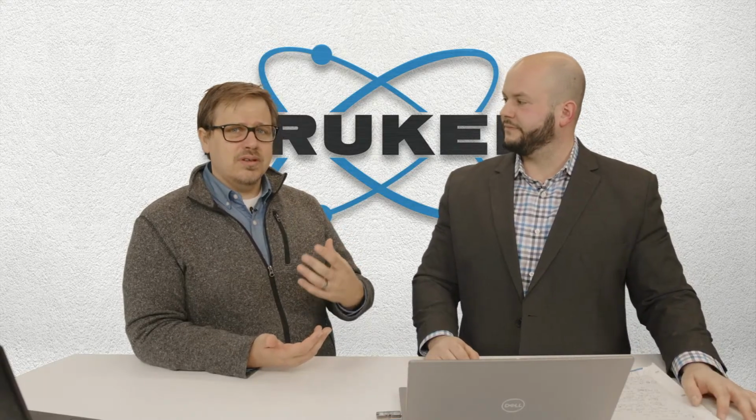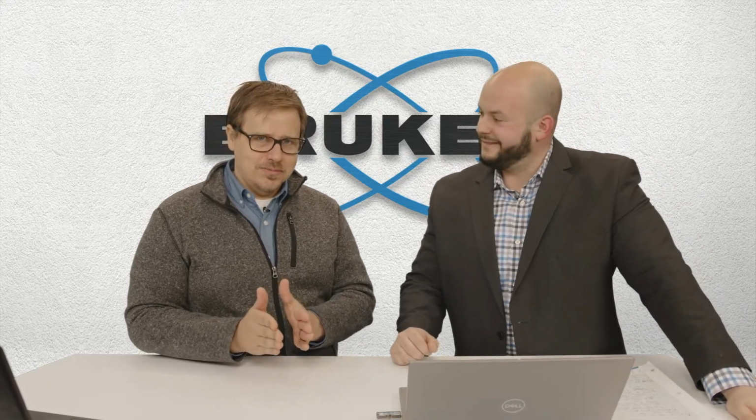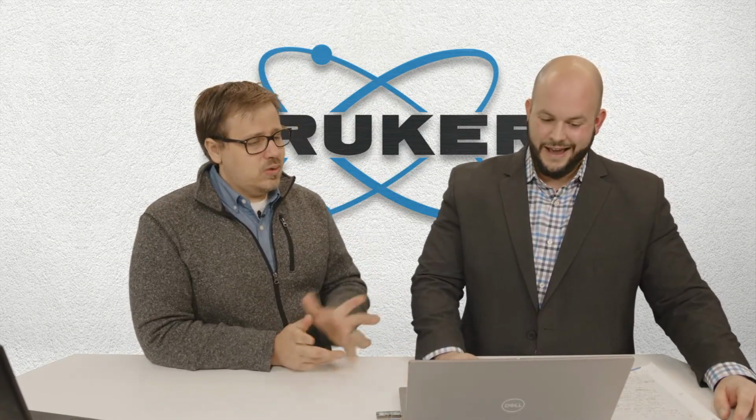One thing to think about, though, is the topic of over-refinement. Right, you can fit anything. You can make the software fit anything you want using almost any parameters you want. So it's a matter of what's realistic. Every good refinement starts at the measurement. You can't get a good value out if you don't have good initial data. Yes, you can make it fit, oh yeah, look at that, it's fit, but is it real? I don't know. So think about that: garbage in, garbage out. You want to have good data to get good results. Couldn't agree more. Okay, so this looks great.